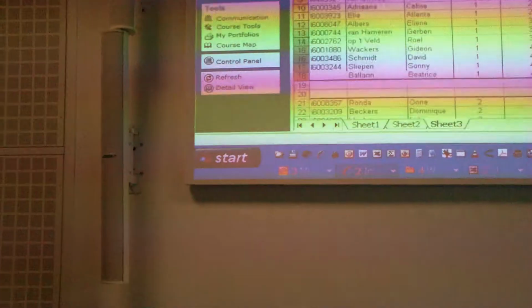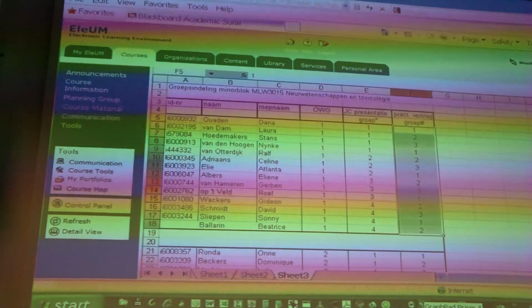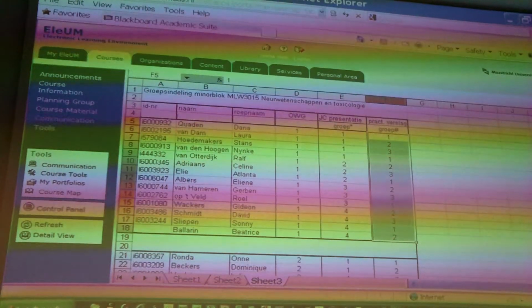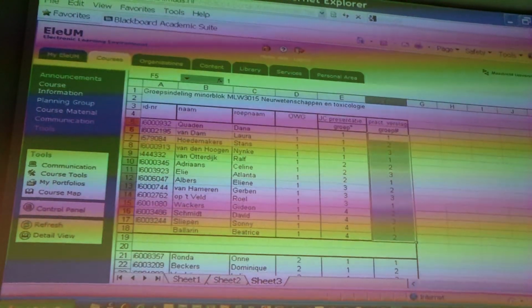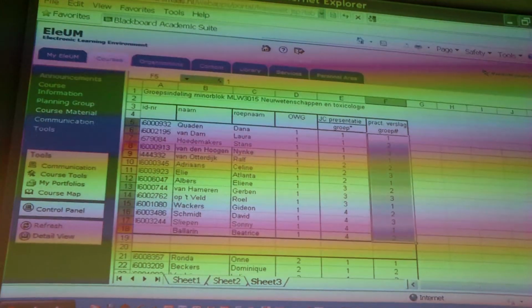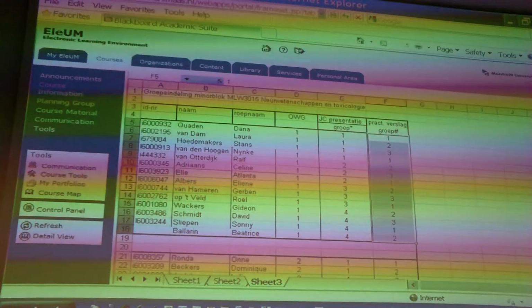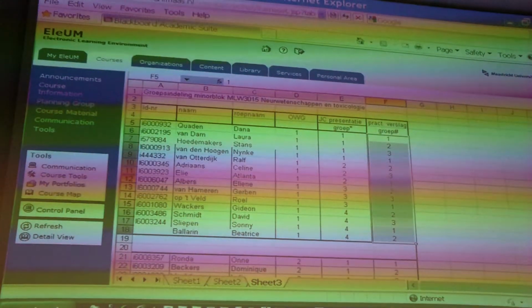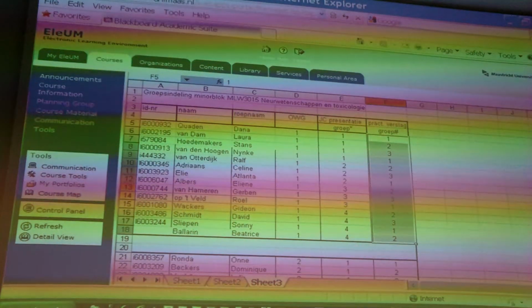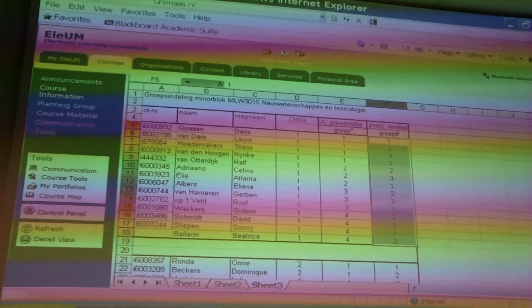I think in the course you must have used an ELISA before. True? What kind of ELISA was it? Just an example, TNF. So, what do you use in an ELISA? What do you need to get started? What are the typical elements that you will use? Secondary, yeah. You picked up a secondary.